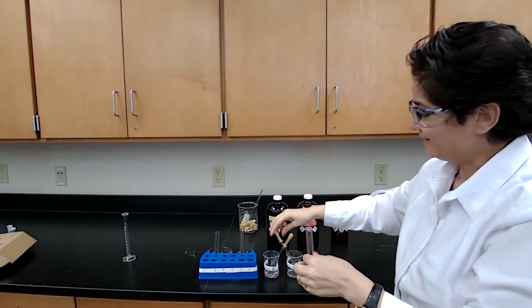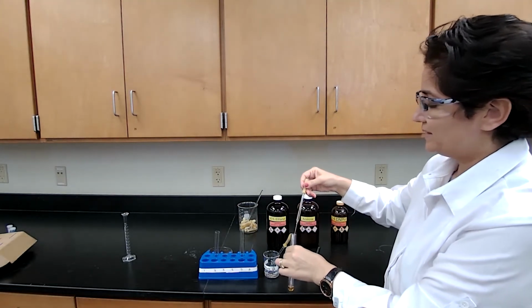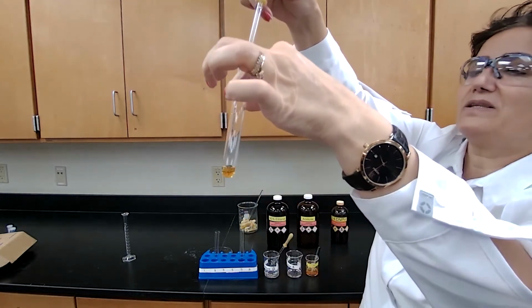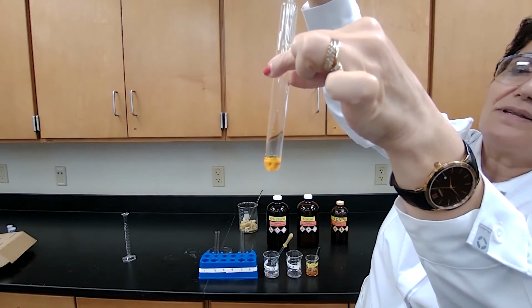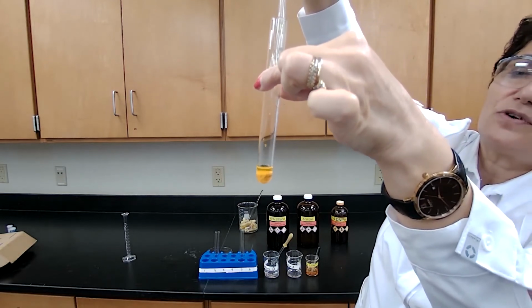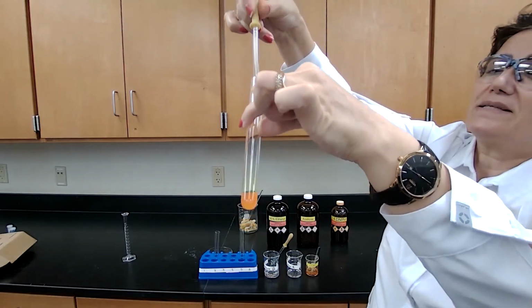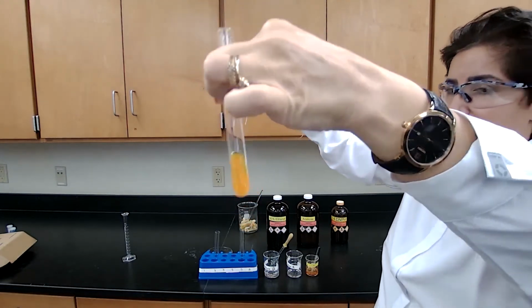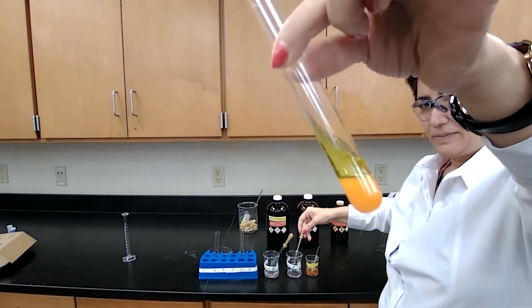But when I add the unknown compound, I want to see if it stays transparent or if it turns cloudy. If it turns cloudy, that would be a positive test for ketone. So in this case, it turned cloudy. I want you to record your observation.